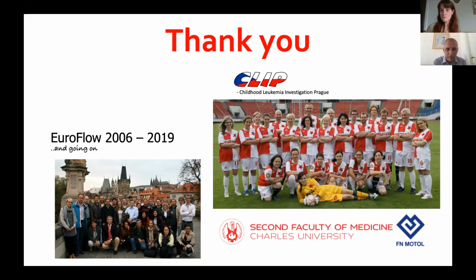Don't say because Tomas Kalina said you can use it for 3 months, just do it. Or Euroflow said, just do it. I say always evaluate what you have and evaluate the factors that contribute to possible degradations to your assay. And if you can prove that it does not degrade, that you have a full control of your reagents, then reuse it. Thank you, Tomas.